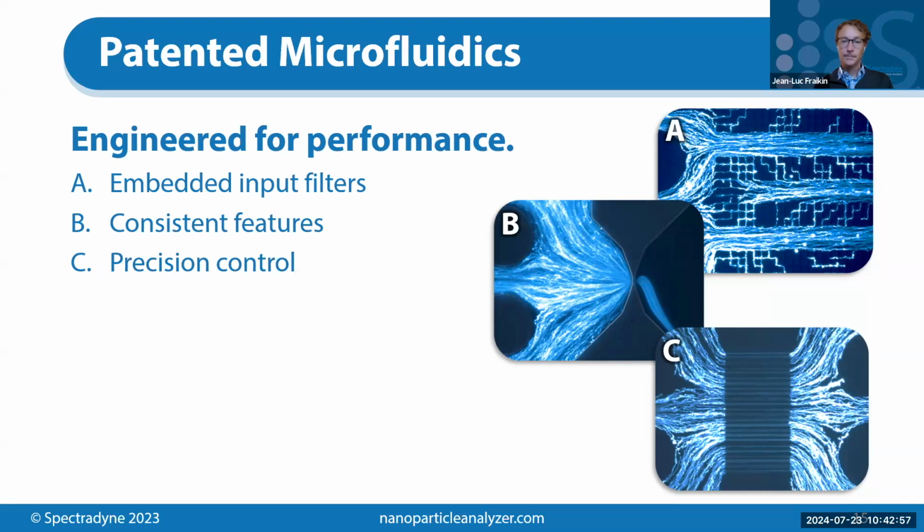Okay, there's a question about does particle compressibility affect size assessment? I don't believe so. It'd be very hard to check, I think, probably. But one thing to keep in mind is that all the flow through the cartridge is laminar flow. And so there's really not a lot of compression of the fluid.